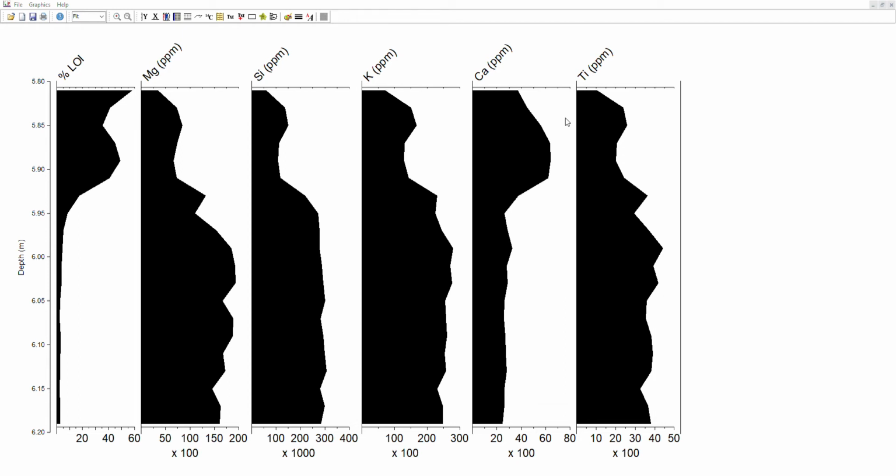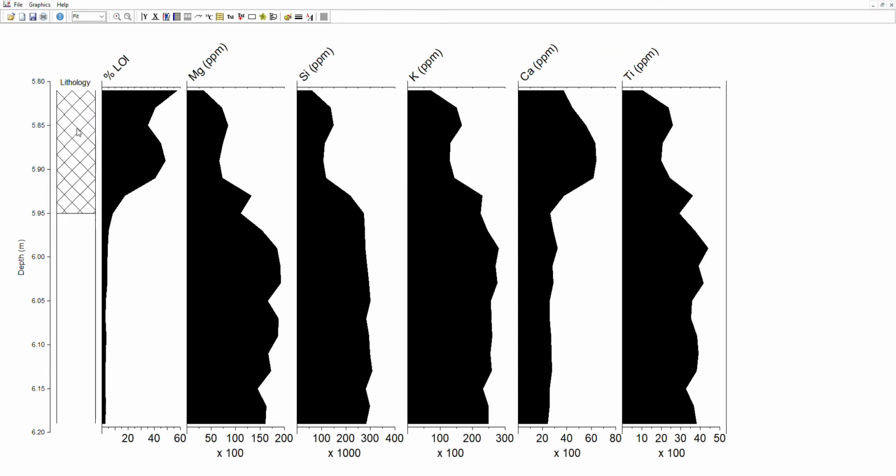What you have to do, and you'll only make that mistake once, 5.81, what did we say, 5.95, click on the lower boundary, LD1. You have to click this post edit, this little green tick box in this little window here. It says no data to display. If we tick the post edit box, that little green tick, that then goes down into here. And now if I click OK, now it will appear.